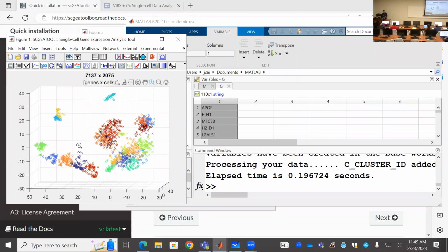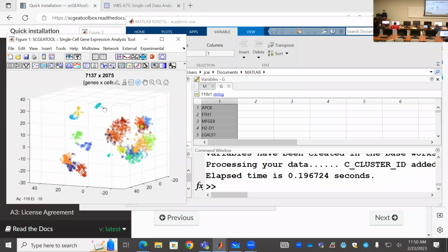Basically that's the way I want to do it. At the end you have to check those marker genes one by one to make your own decision, see whether you separate these two into two subclusters or not. So there's no machine learning, no artificial intelligence. It's all human intelligence getting involved here.